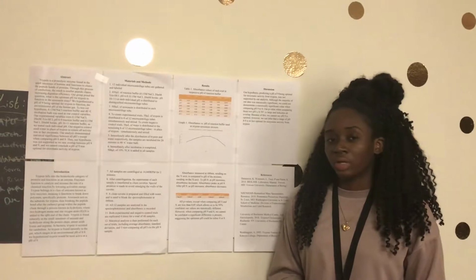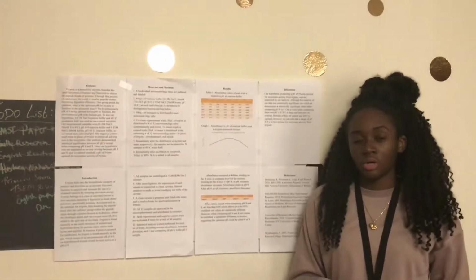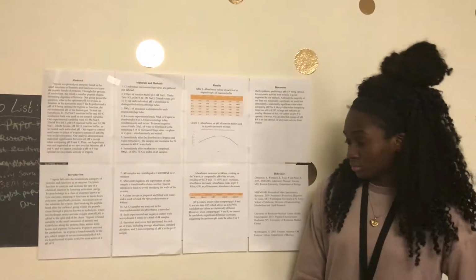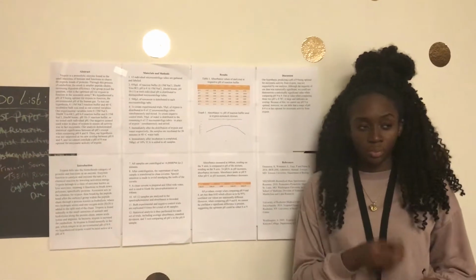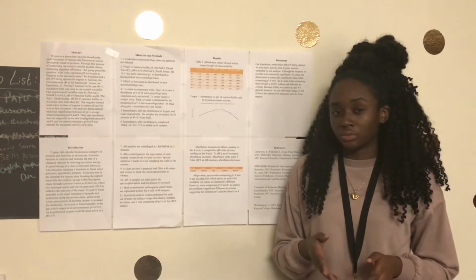And then after that, we added 500 microliters of azocasein into the 12 microcentrifuge tubes.